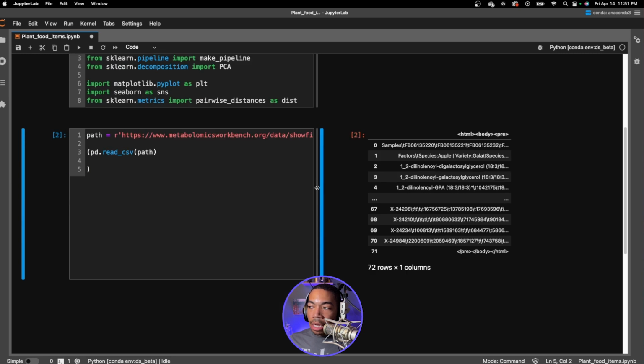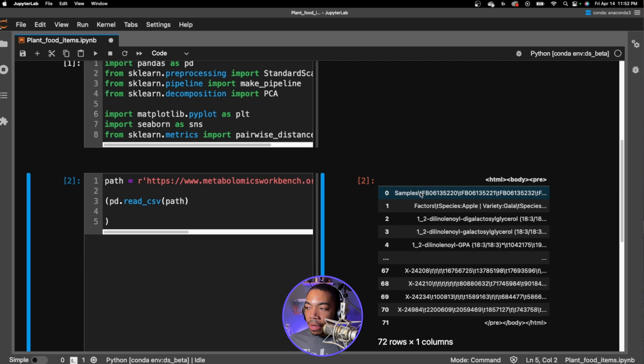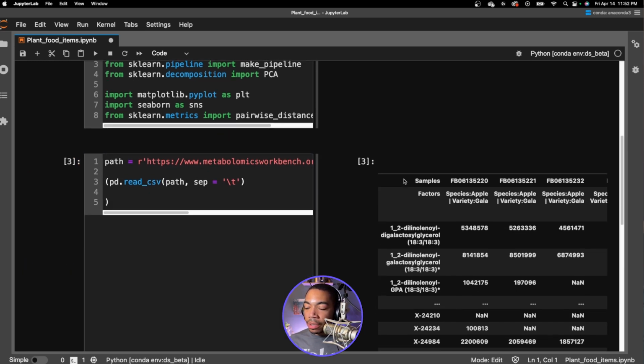And then let's hop to side-by-side mode so we can see how we change the output of this table as a function of the various arguments. And so when we run this, the first thing you might notice is that we have these backslash T's present. Let me make the font a little bit larger. We have these backslash T's present. So this tells you that the default separator is not a comma, as is inferred by CSV. And so let's improve that as well. So let's change the sep to backslash T to match this separator and look at that output.